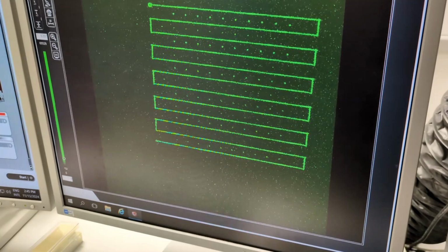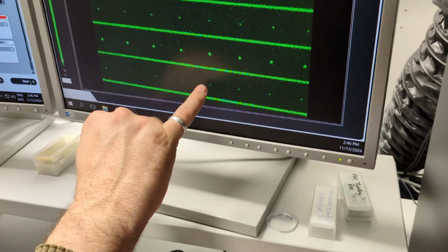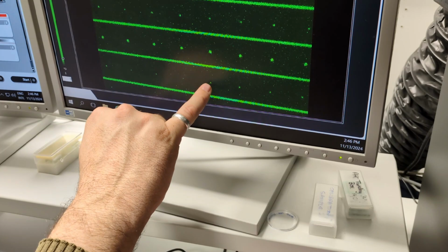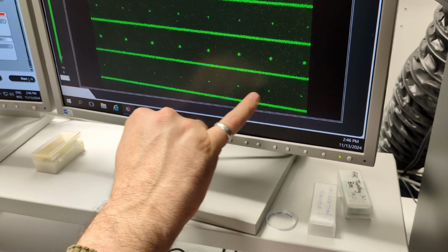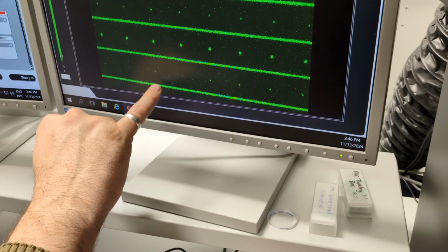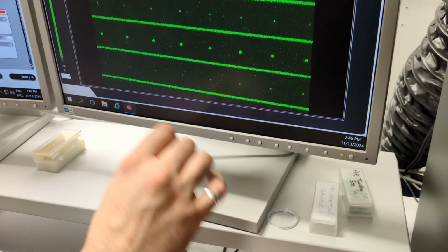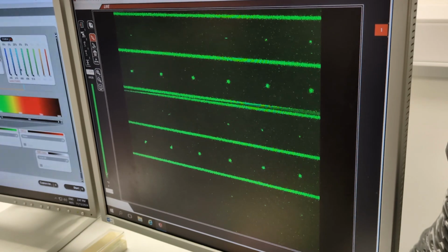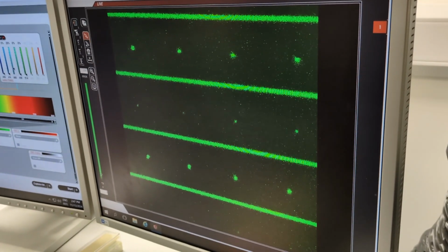Don't forget that the single point power series is 10 microns shallower than the bounding boxes for the 3D point arrays. Once you have the single point power series in focus, you'll see that the point sizes get smaller towards the base of the pattern. The sub-resolution features are in the penultimate row. Whilst all of the features in the penultimate row are sub-resolution, there will be some variation in the absolute brightness.